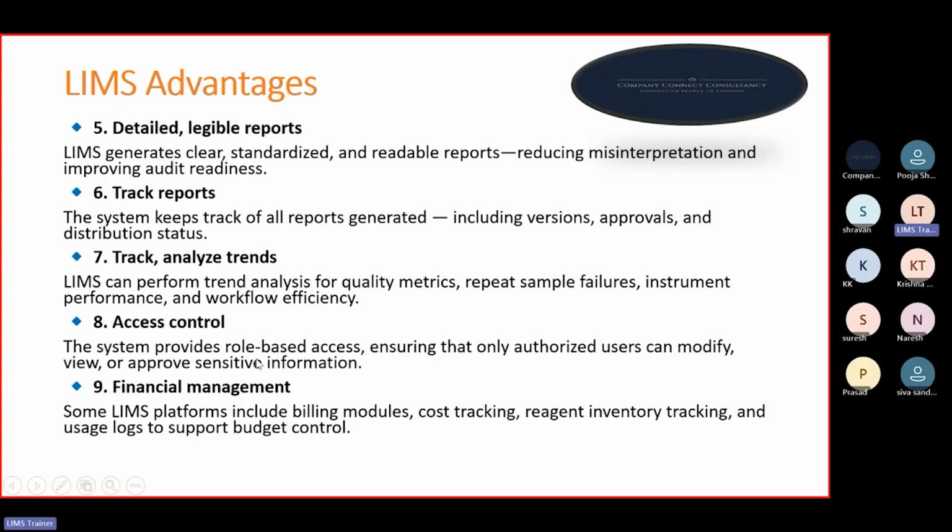Financial management. Some LIMS platforms include billing modules, cost tracking, reagent inventory tracking, and usage logs to support budget control. So this LIMS software also provides inventory tracking, inventory management, cost tracking, and billing modules, and it is also very cost-effective software. If you are working manually, then you need to do a lot of paperwork. You need to maintain that paperwork, you need to maintain those files, and a lot of storage will be required for that. So that is not required here. So these are some advantages of the LIMS.